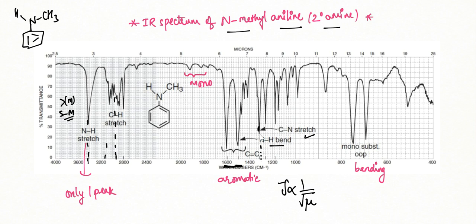So we can also calculate the frequency, and then we can be sure that this value is there for the carbon nitrogen band. Okay, what about the substitution at benzene? For benzene over here we can see only one carbon substitution. So for mono substitution we had two signals, two peaks of almost equal intensity, and they're also strong peaks, right?